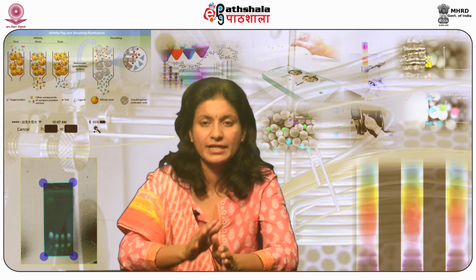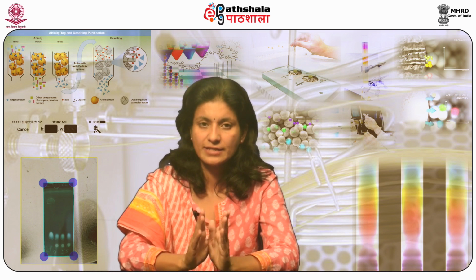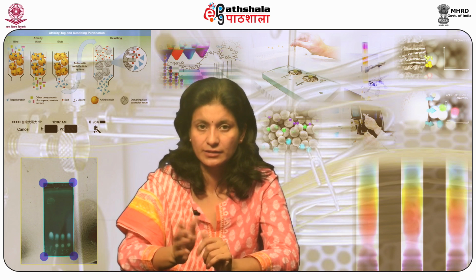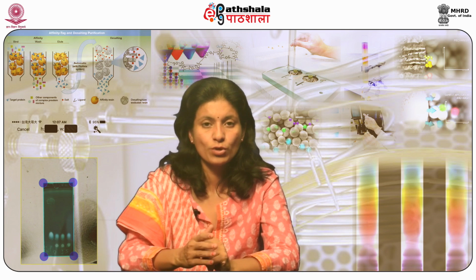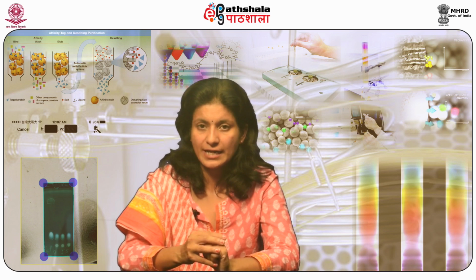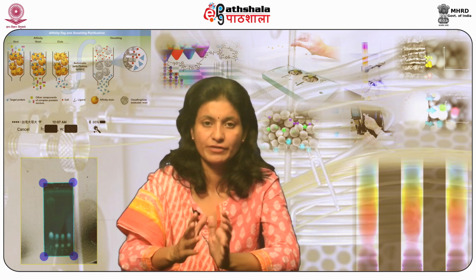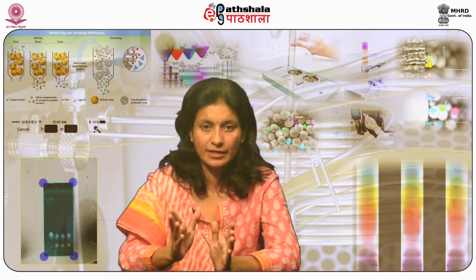Some of the significant examples of ion exchange chromatography in industrial aspects are the evaluation of coolant ionic constituents, for example, sodium hydroxides, ammonium ion, nitrite ion, calcium ion, sulfate ion, etc. Fatty acid investigation and trace sulfate evaluations in brines.